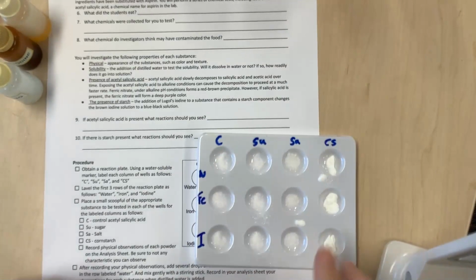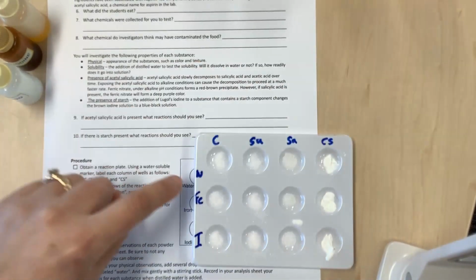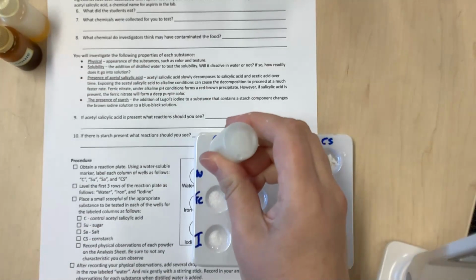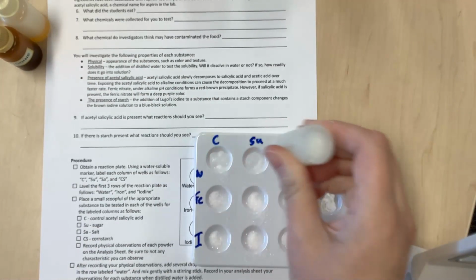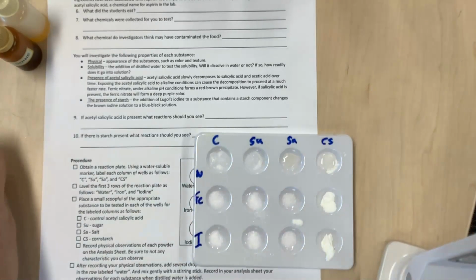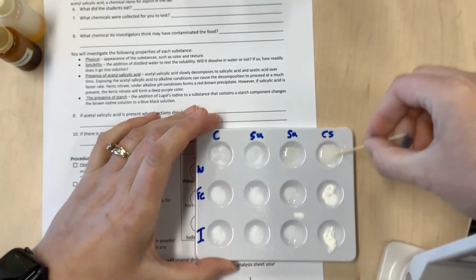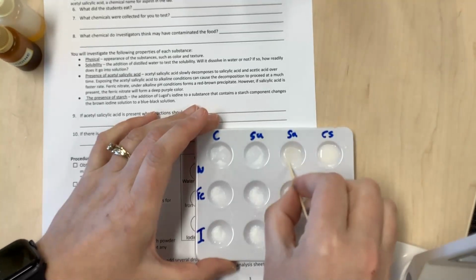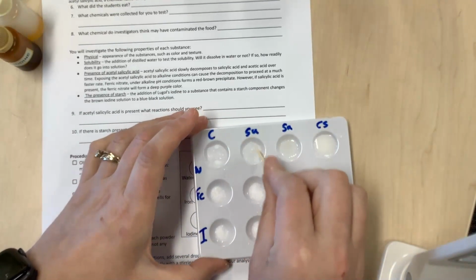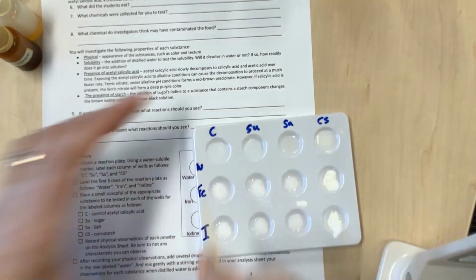Okay, so now I have all my powders in their wells. So I got control, sugar, salt, and cornstarch. Now I'm going to add my liquids. I'm going to start with the water, and I'm going to put a couple of drops, usually 3 or 4 per well. Now, at this point, you can also use some toothpicks to stir and see what happens. And notice I'm using a different toothpick for each well so that I don't contaminate anything. And you can kind of tell what's going on with each one as you go.